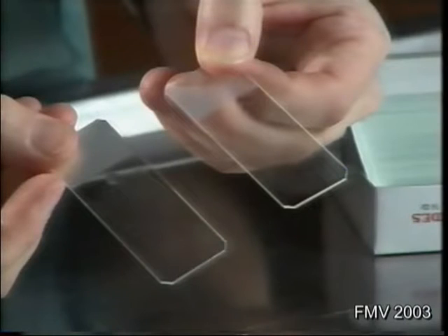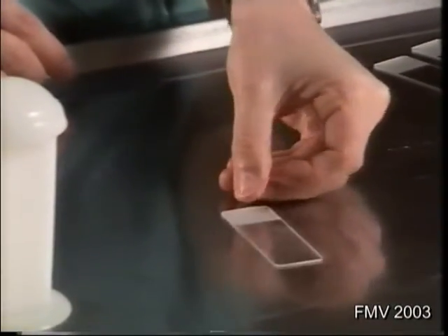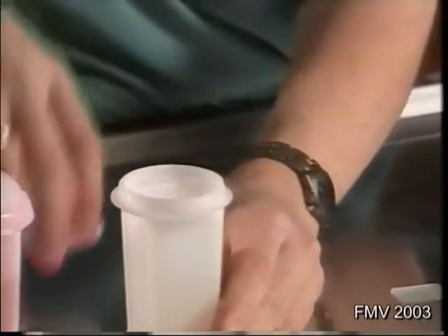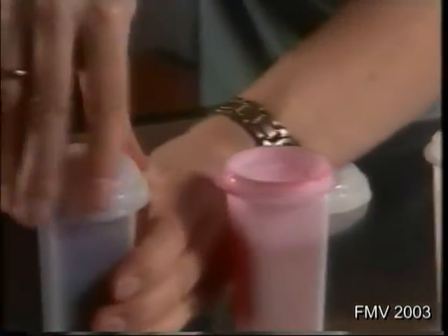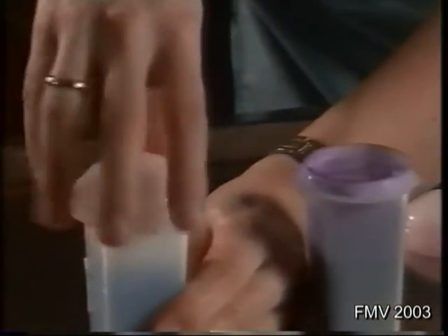If abundant clear fluid of low cellularity is obtained, it may be centrifuged to concentrate the cells. The sediment obtained after centrifugation can be used to prepare the slides. A modified Wright stain can be used to stain cytologic specimens. The thicker the smear, the longer the glass slide should soak in each solution. Do not soak the slide less than 10 seconds in each solution, and allow equal soaking time in each solution.